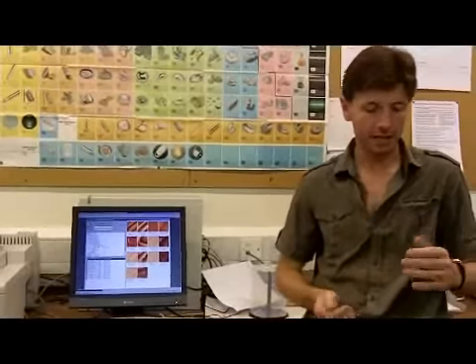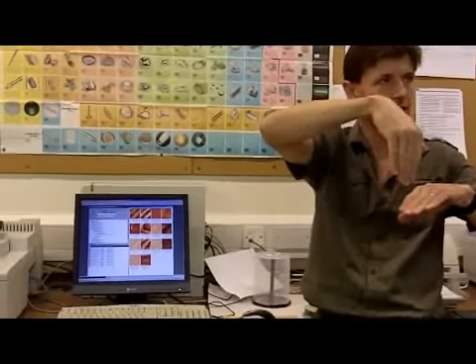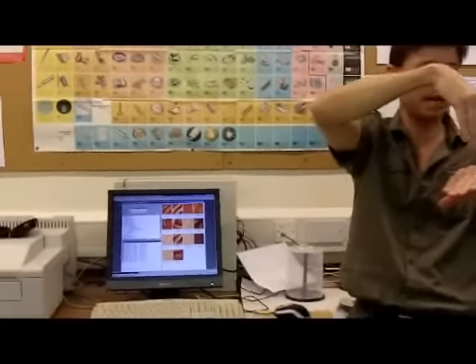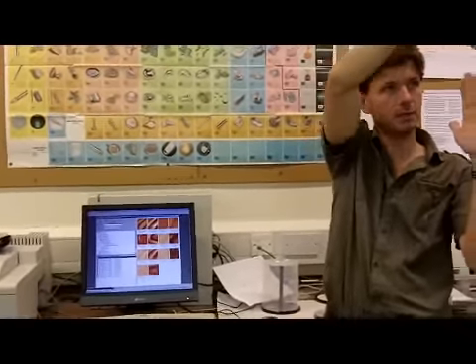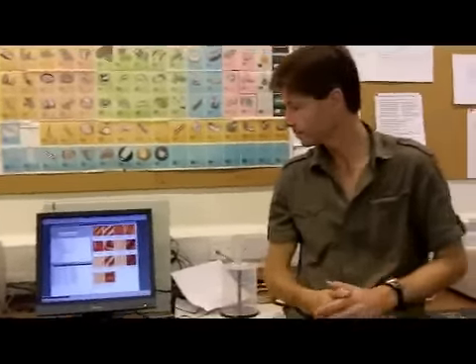So the other mode of scanning is to take your tip, and as you're scanning across the surface, where it starts to see an increase in current as it approaches something sticking out, you move your tip up and then move it down when you get to the other side. And that can cope with a brick wall, it just moves up over it. And that's called constant current imaging.